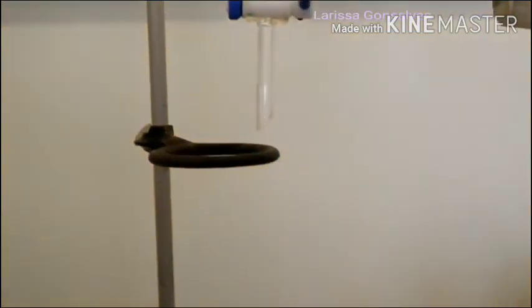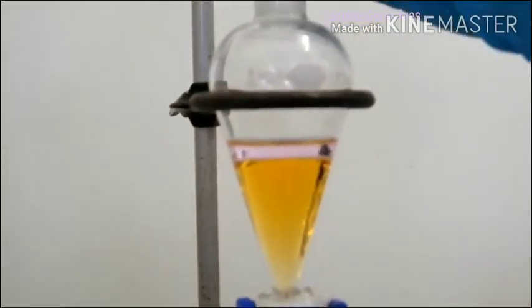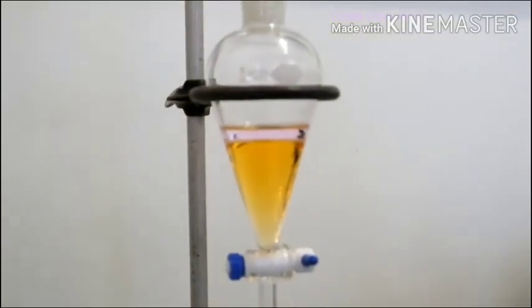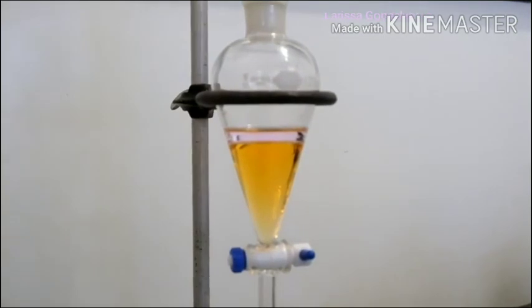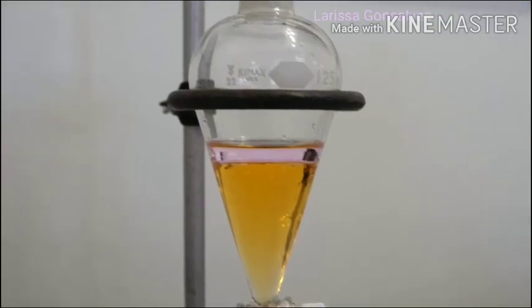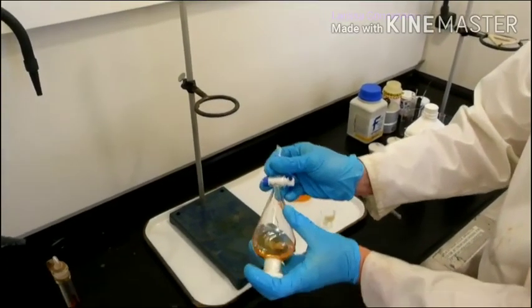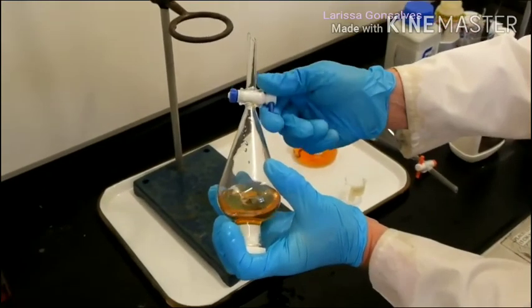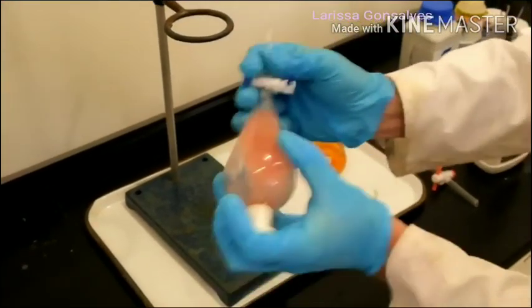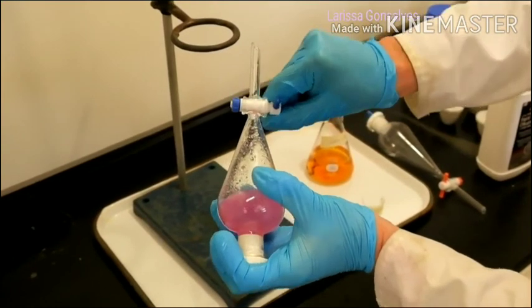Paint thinner is immiscible with water, and since the density of paint thinner is less than water, the paint thinner forms a colorless second layer on top of the orangish aqueous layer. Since iodine is more soluble in paint thinner than water, when the contents of the separatory funnel are mixed, the iodine will move from the aqueous layer into the paint thinner layer.